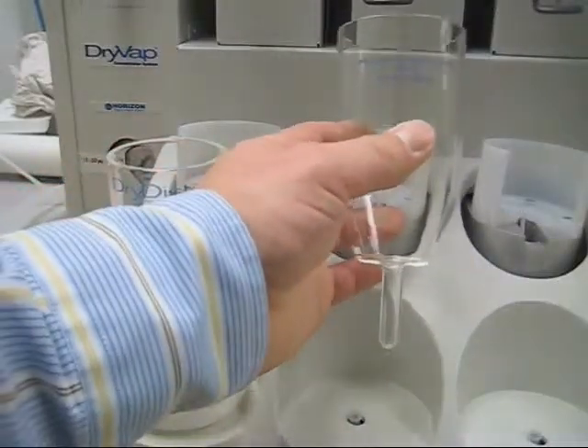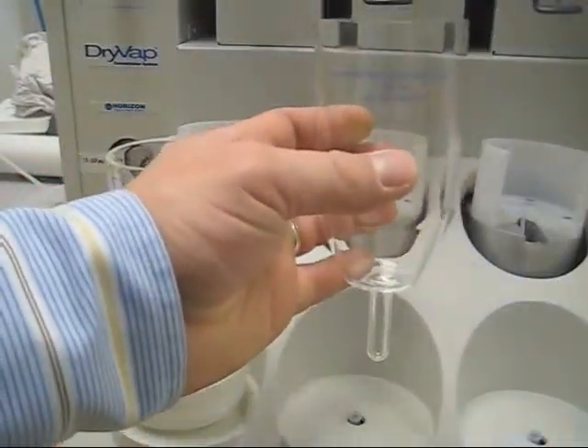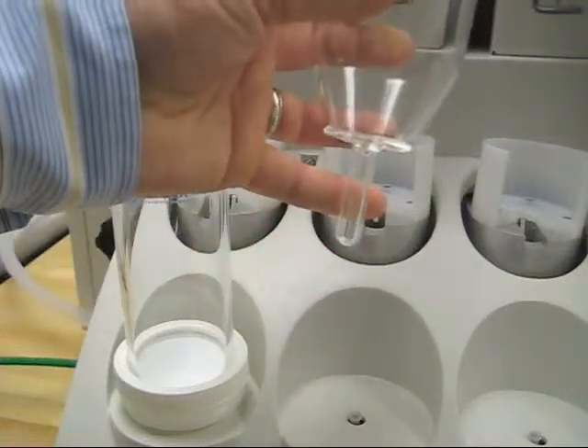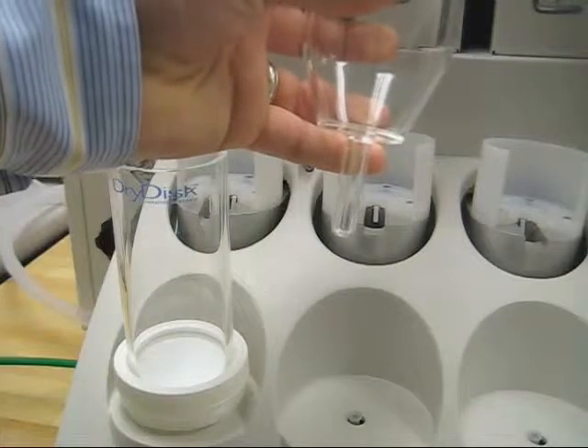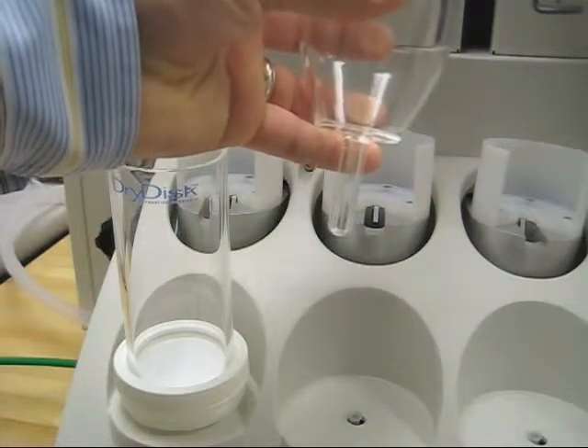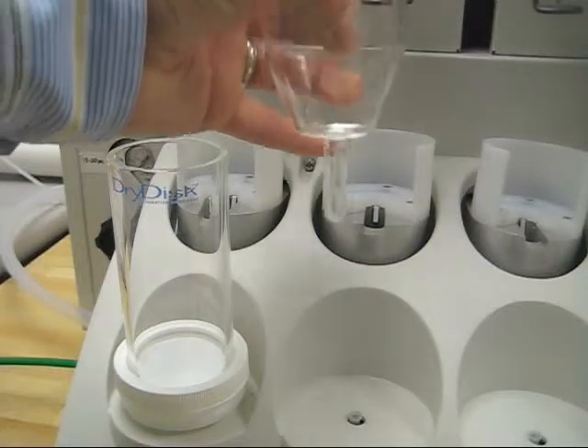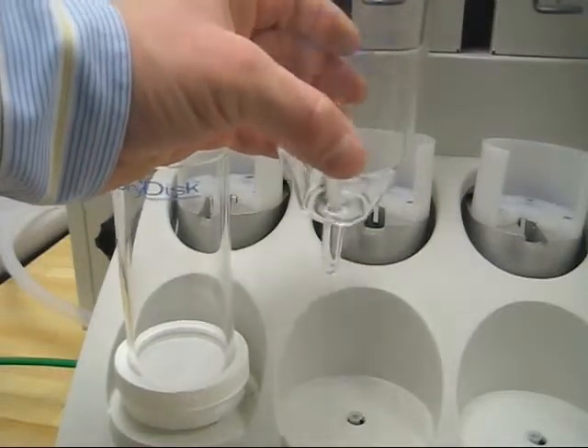This is your concentrator tube. It actually has two markings down here at the bottom — one is for half a mil, and the one up here is for one mil. Half a mil is just an indicator. This piece of glassware right here will shut off automatically at one mil.